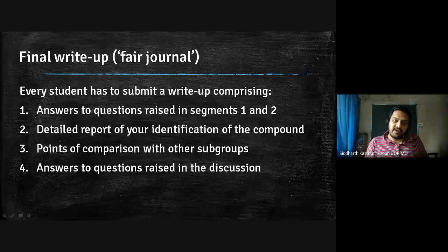If you are given multiple data, for example, if you are working in material science, normally to characterize a material, you need either TEM, Raman, FTIR. Means there will be 3 or 4 correlated measurements which you make, and you make the main conclusion from one measurement and a confirmatory conclusion from the other measurement, and vice versa. Like that, you can draw several conclusions about the whole material.